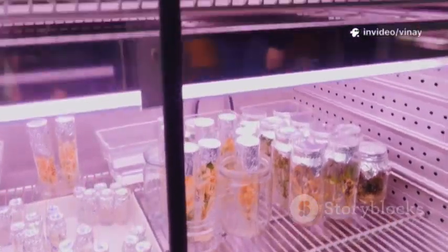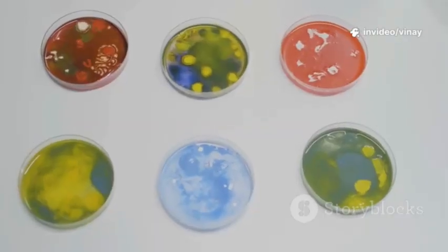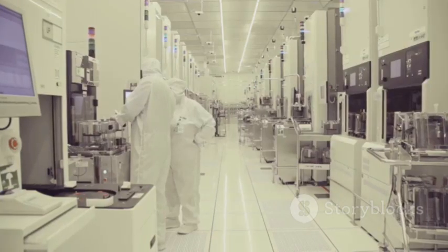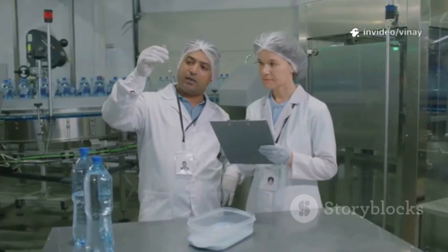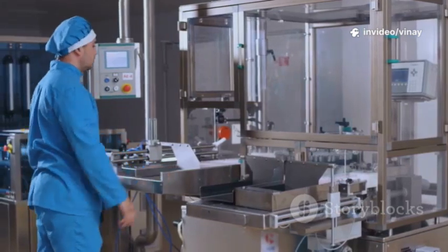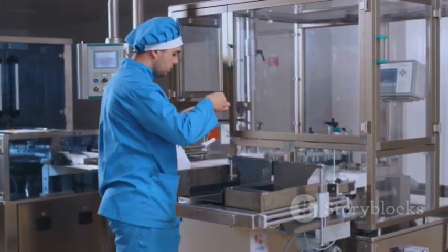The filled units are then incubated for at least 14 days. If any unit shows microbial growth, it indicates a breach in aseptic technique. A successful media fill with 0 contaminated units provides the highest level of assurance that the process and the operators can produce a sterile product. Operators must participate in these media fills, typically twice a year, to maintain their qualification.